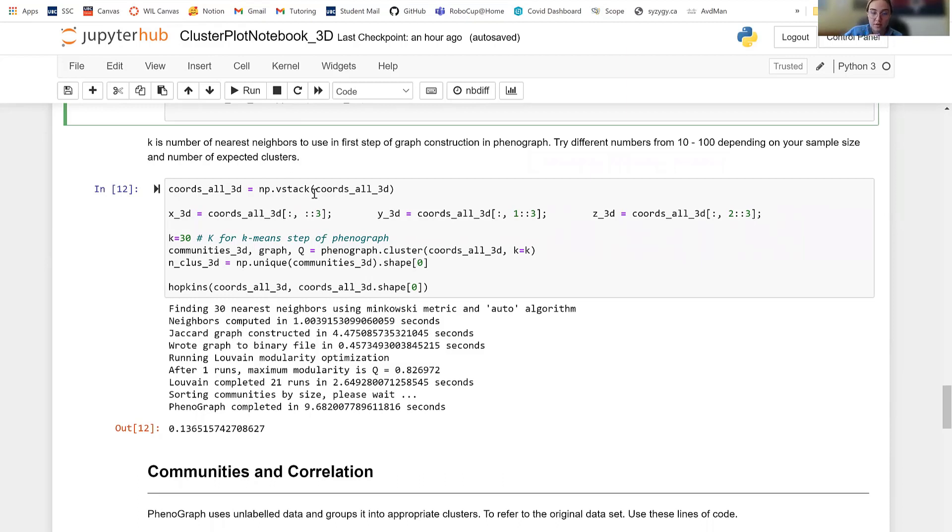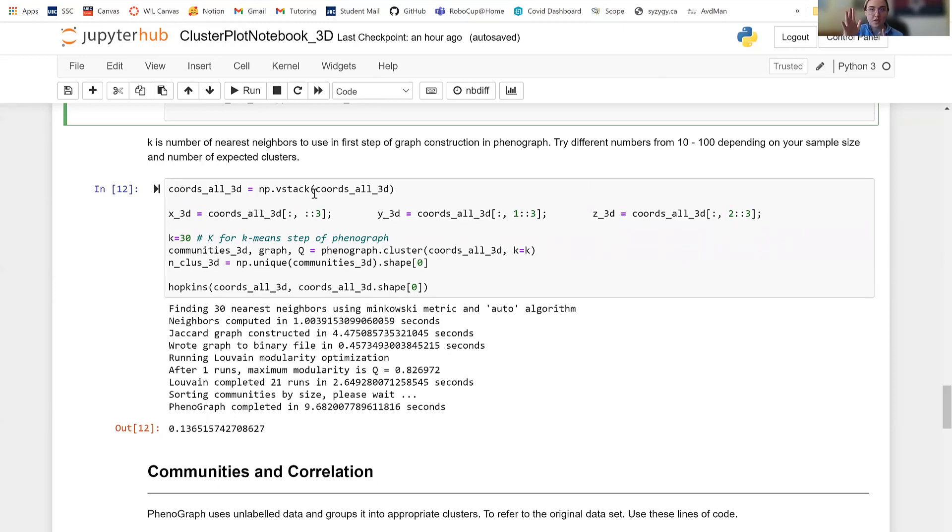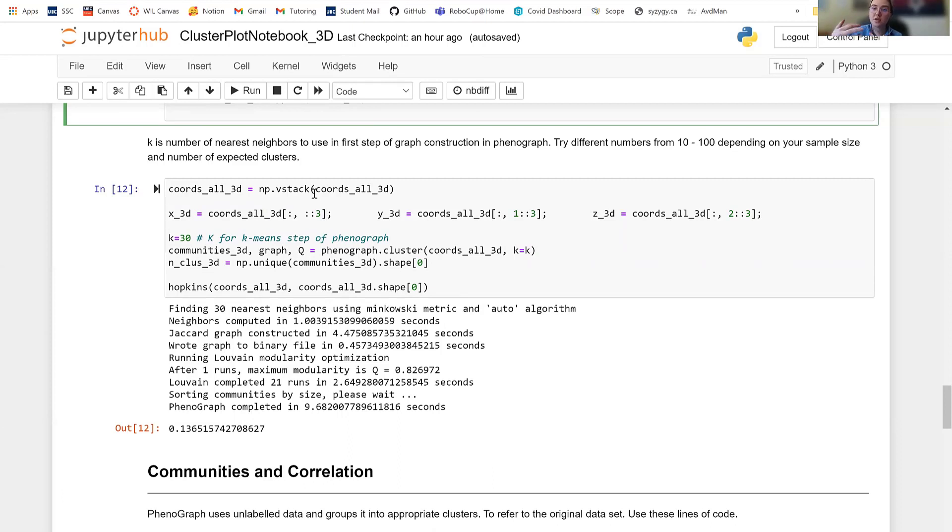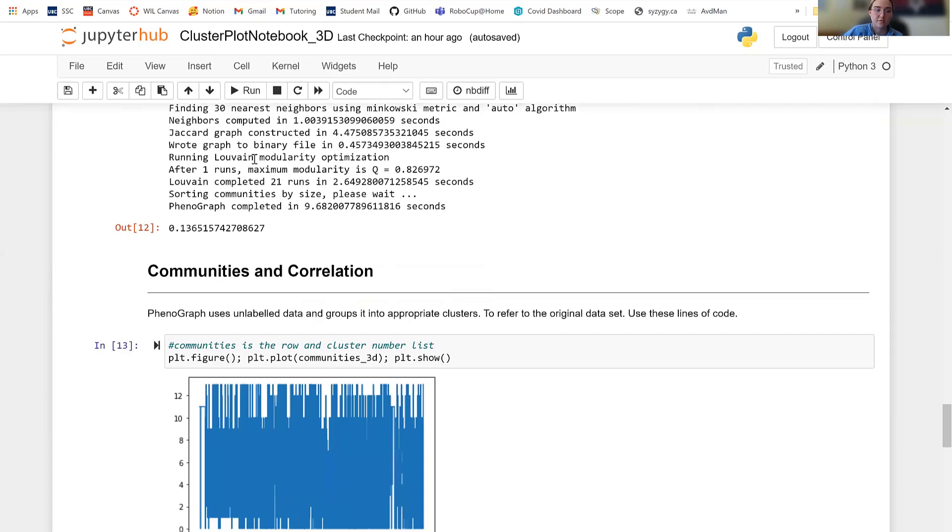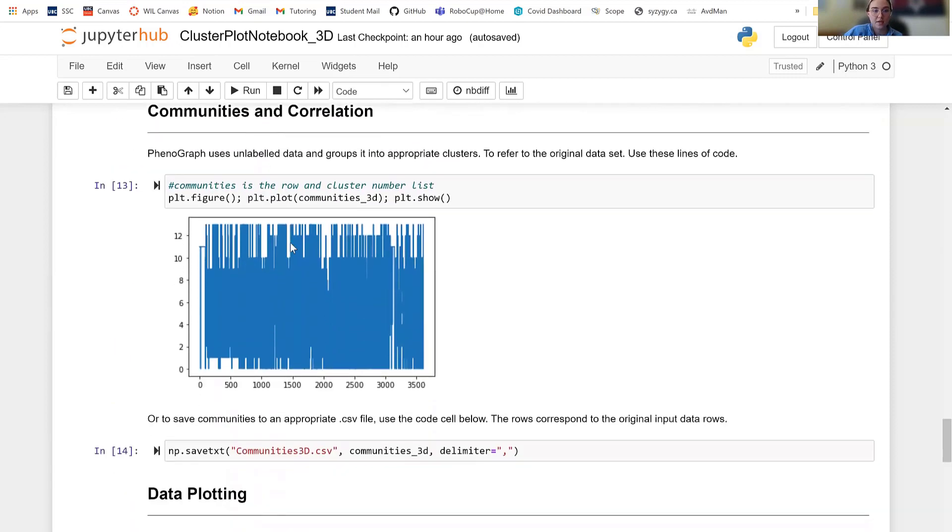I suggest that you try different numbers from 10 to 100, depending on your sample size and the number of expected clusters. K, it's important to note that K is not the amount of clusters that you're going to end up with. It's the amount of neighbors that each individual point has to have. It doesn't, it might not make sense, but if you run it a couple times with different K values, you're going to get a different number of clusters, different shapes and sizes of clusters. So I suggest you play around until you get a result that kind of looks or makes sense to you and the data that you're looking for.